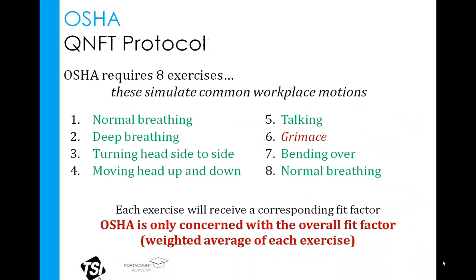So in reference to step 12, here are the fit testing exercises as required by OSHA when performing a fit test with the PortaCount system. There are 8 exercises in all. I believe most are pretty self-explanatory, but I would note that exercises 3 and 4, head side to side and head up and down, do not need to be done at whiplash speeds. Just a continuous and steady motion will suffice.